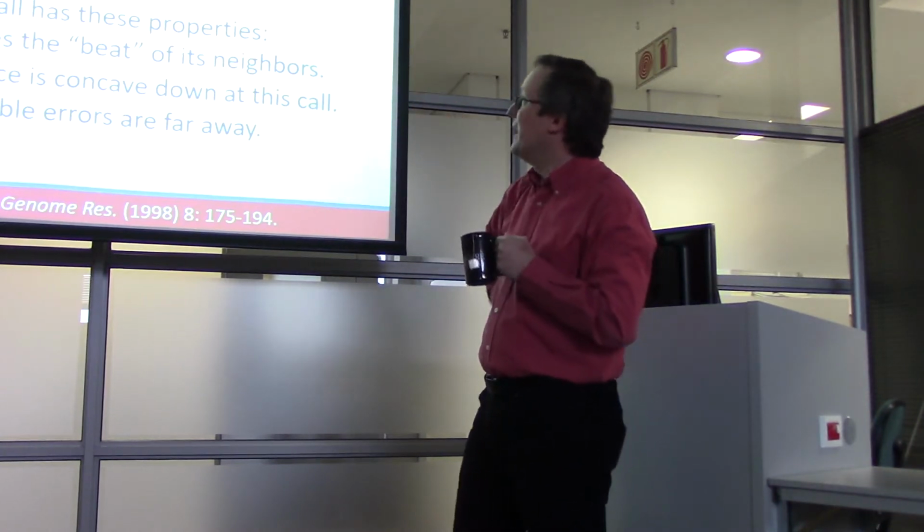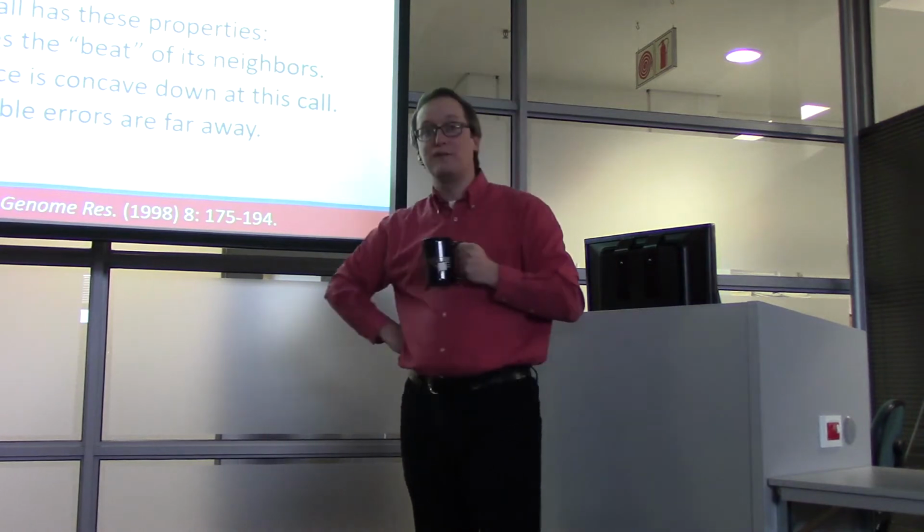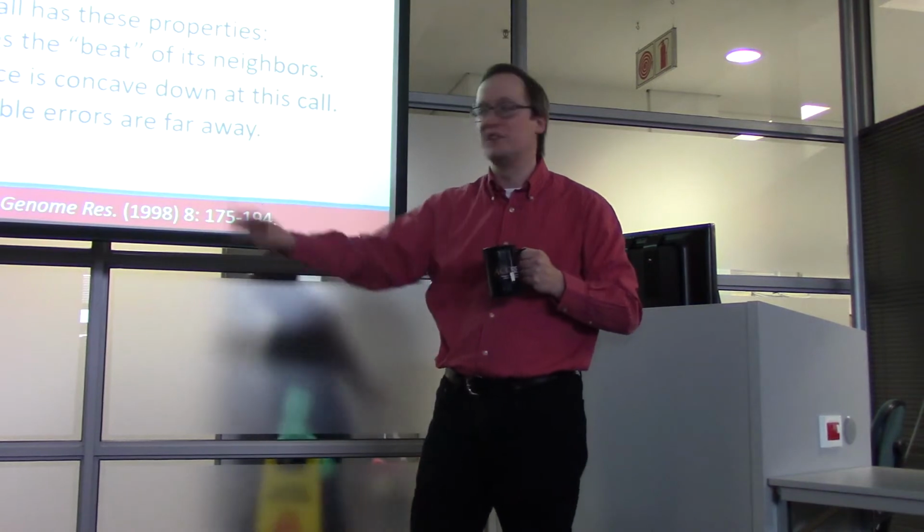All right, so how can we estimate individual base calling errors? First off, we need to infer a sequence from the electropherogram. We have to have something that says these letters go with these positions.